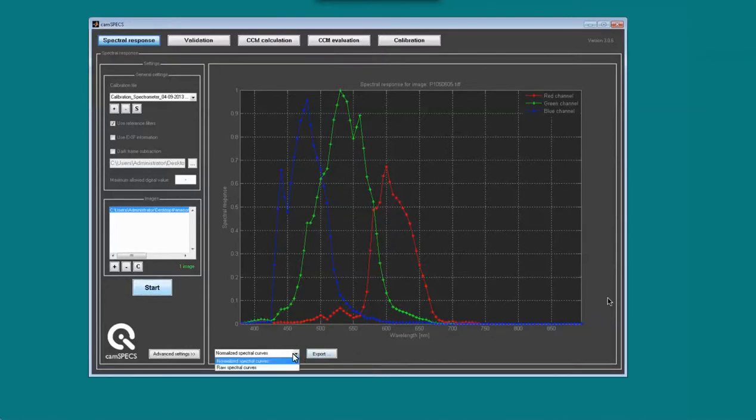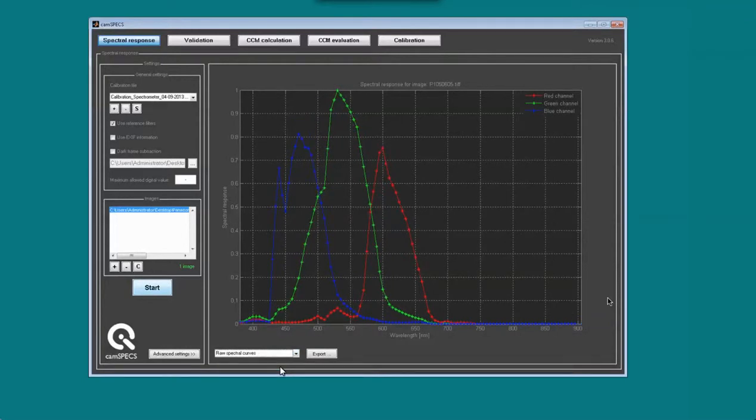In this menu, you can choose between the raw data, which means these are the raw gray values from the raw image with the Bayer pattern, XYZ, or RGB. RGB channel. A spectrum. Oh, this is the normalizer.